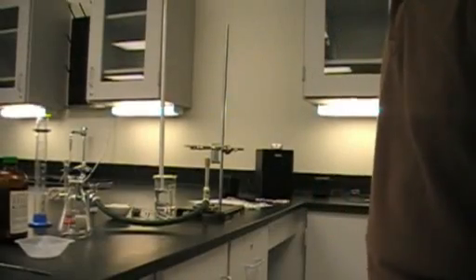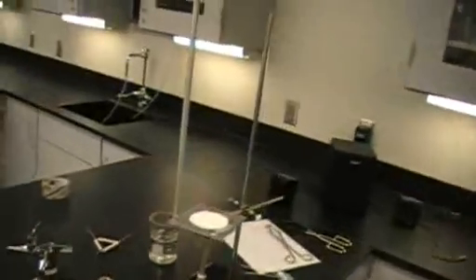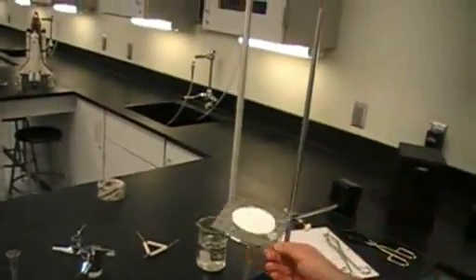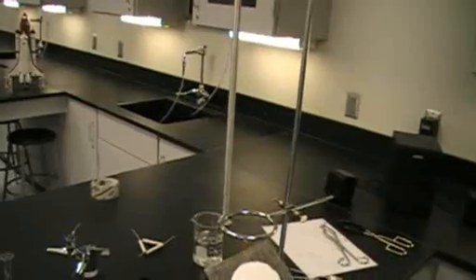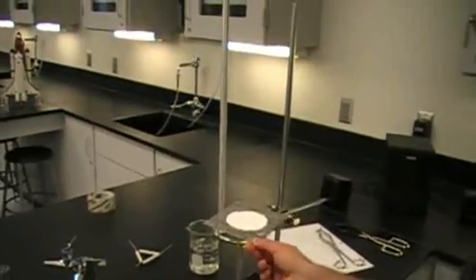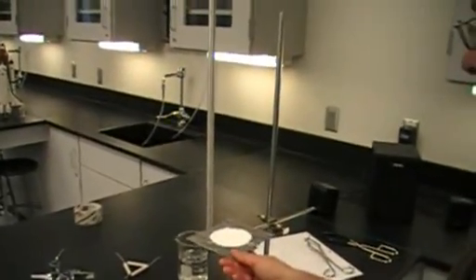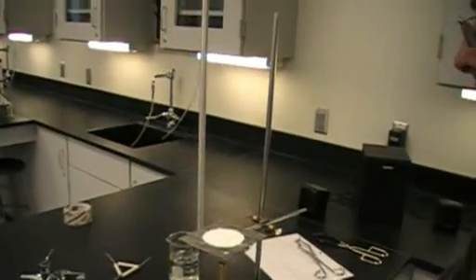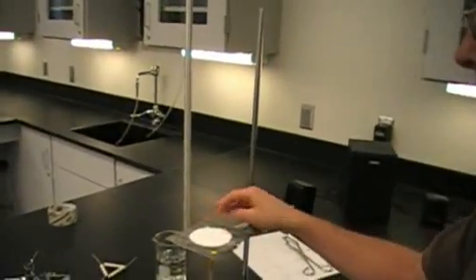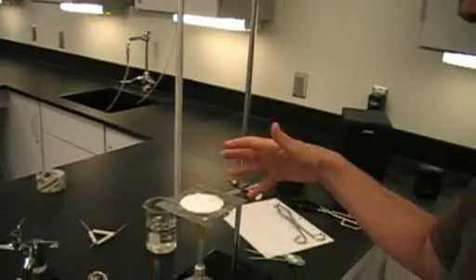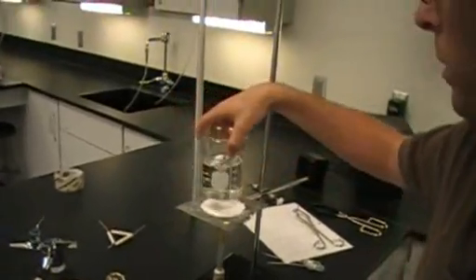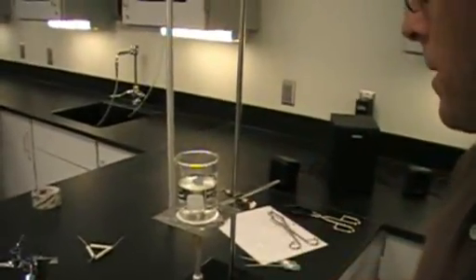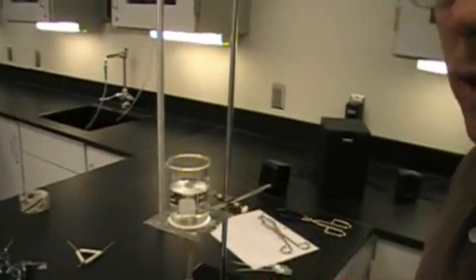All right, the next thing we are going to look at is another setup for heating. And this is, again, we have a ring stand. We have an iron ring. But instead of using the triangle, this time we are going to use wire gauze. And essentially the use for wire gauze is it evenly distributes the heat. As soon as I turn the Bunsen burner on, it will hit the ceramic portion, that is the white. It will kind of evenly distribute that. So if we are heating something like water in a beaker, the wire gauze helps to support the weight of the glass. And the ceramic is going to help to kind of evenly distribute that heat.